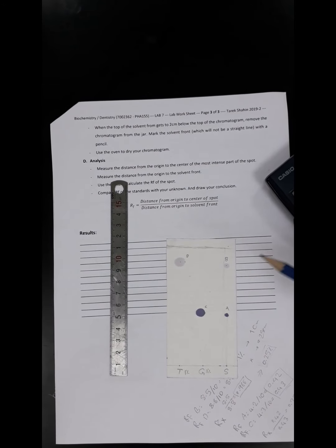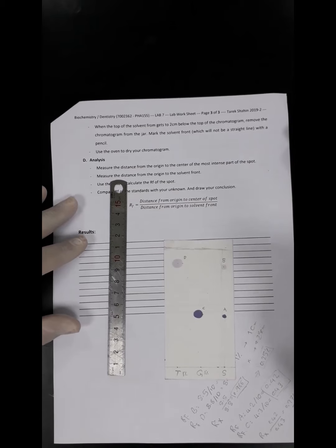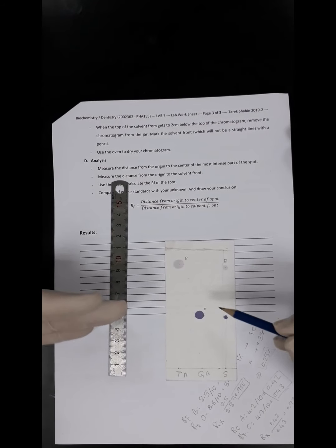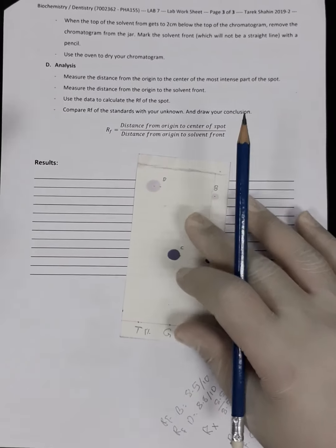This type of chromatography we call ascending chromatography, because the mobile phase ascends over the chromatographic paper. We have many other types of chromatographic analysis, but this is the very basic idea. By reaching this point, we have achieved the aim of this experiment, which is the chromatographic analysis of amino acids.